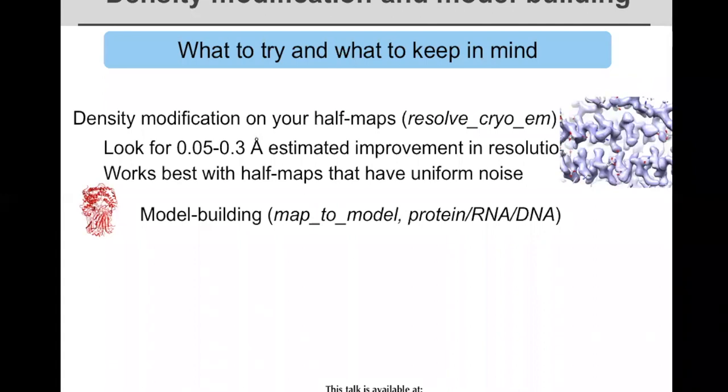It's actually done one at a time, and then whichever fits a piece of the map better, that's the one that's kept. But you can do it for anything, including a ribosome. Takes a long time, and best on multiprocessor or SunGrid engine machines or something like that with lots of processors. Really helps if you have something that's very big.